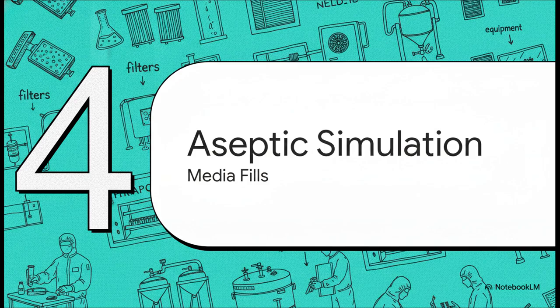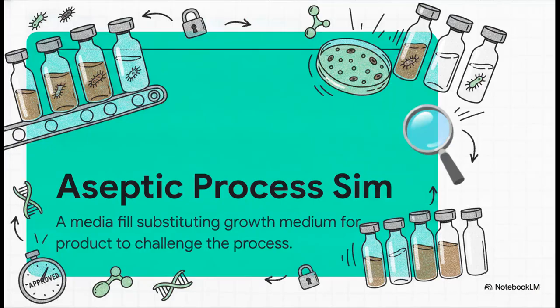Section 4, Aseptic Process Simulation. Now that we've talked about filters, we need to focus on how we challenge the higher-risk aseptic process itself. An aseptic process simulation, or APS, is a media fill that substitutes sterile microbial growth medium for your actual product to challenge the aseptic process.